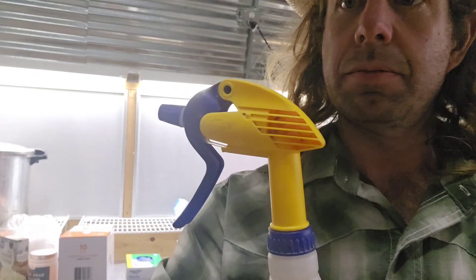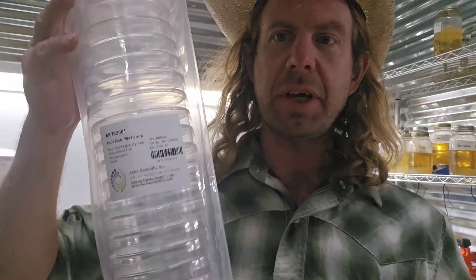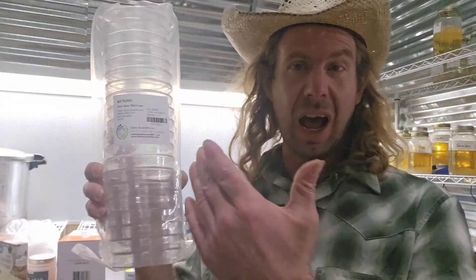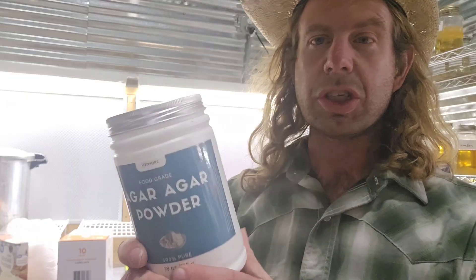Number four: petri dishes. These are sterile petri dishes — I buy them by the box of 500 or so typically. These are some really nice ones; the brand is AKA Scientific — just what I've been using, I like them, they work good. Number five: time to fill those petri dishes up — agar powder. Agar agar is a main ingredient in our agar mixtures, whether it's malt extract agar or potato dextrose agar. You are going to need some agar powder.